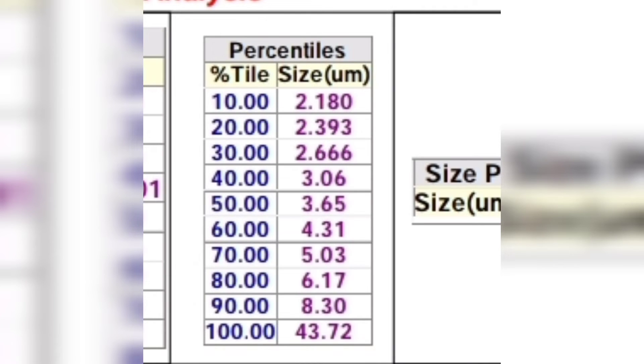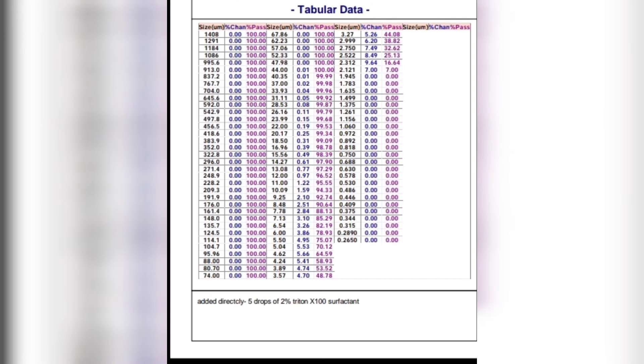The percentile table shows the distribution of different sizes in percentages. The tabular data shows the percentage passing of each size.